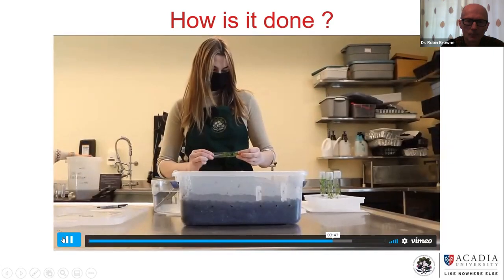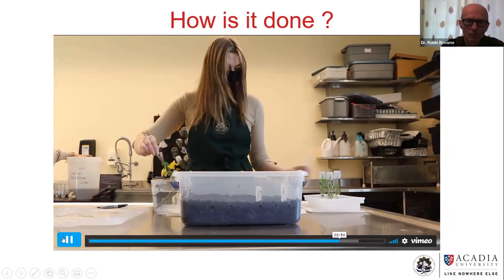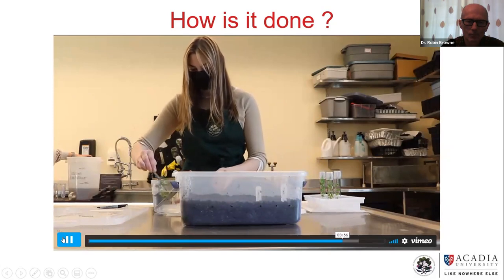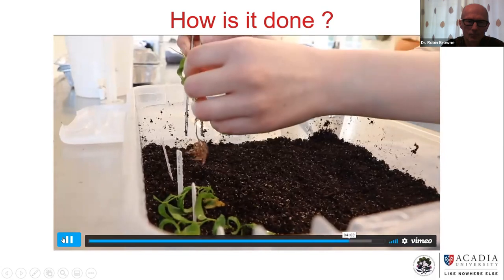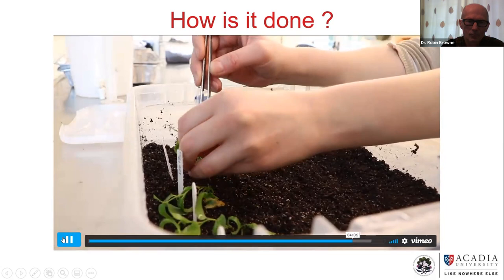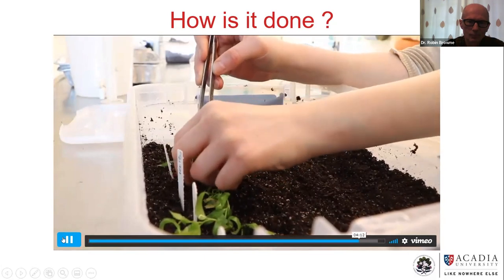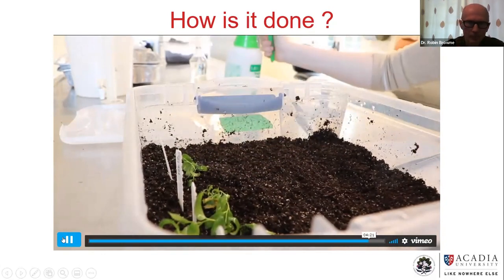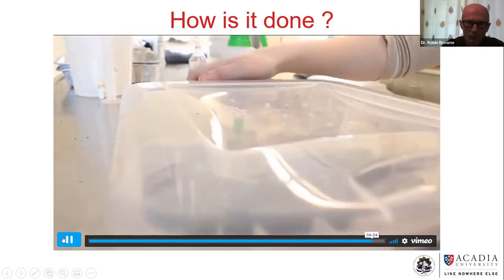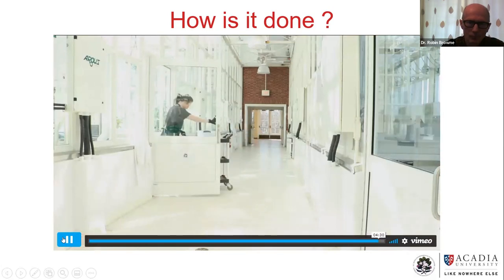Once a sufficient culture population has been multiplied, it is then possible to reintroduce these plants back to a greenhouse or field environment. This stage is called outplanting. Shoots or plantlets, depending on whether roots have formed at this point or not, are removed from culture, cleaned of residual culture medium, and placed in a suitable growing substrate, which is usually a peat perlite mix, to be maintained under high humidity for a 2 to 3 week acclimatization period. This is a critical step for the process to ensure the sensitive plants from culture make the proper adjustment to the harsher greenhouse and field conditions without significant losses.